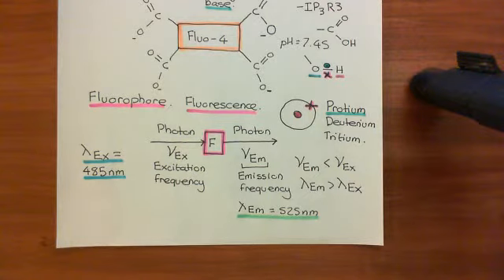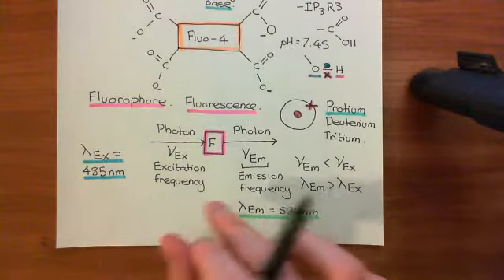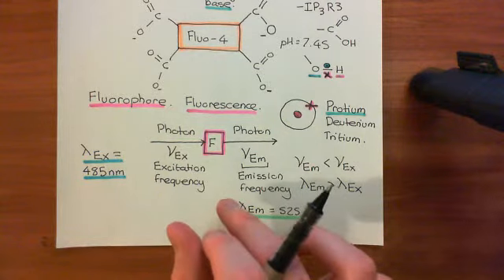Right. So what's so incredible about Fluo-4? How does this all relate to calcium? So far, all we've seen is that I can shine blue light onto Fluo-4 and get green light back again. Well, you can do that. You can take pure Fluo-4 molecules and shine blue light onto them, and the amount of green light that you will get back is not great. So Fluo-4 is not actually that great at doing this.